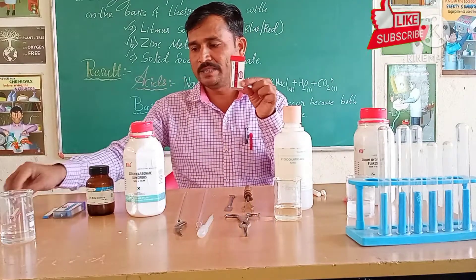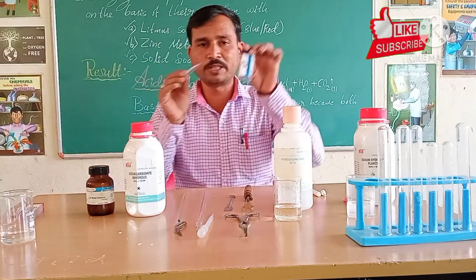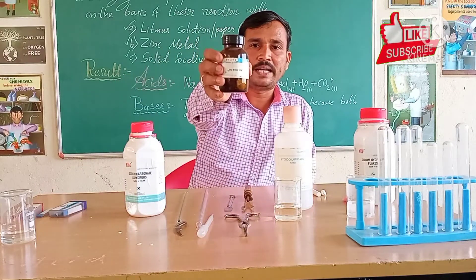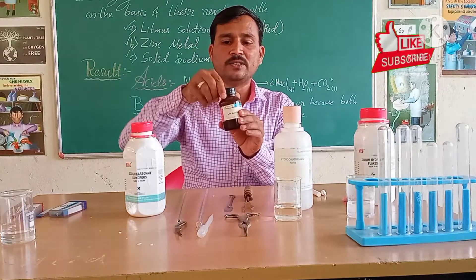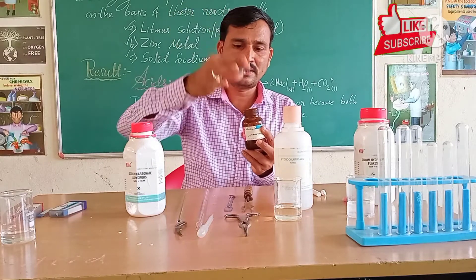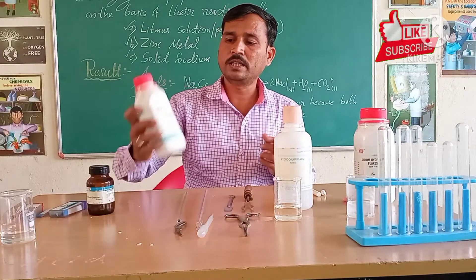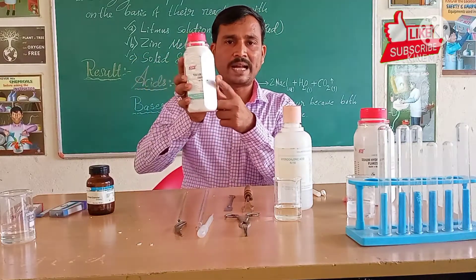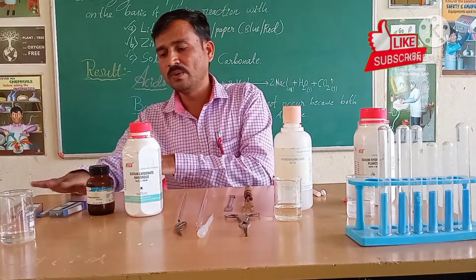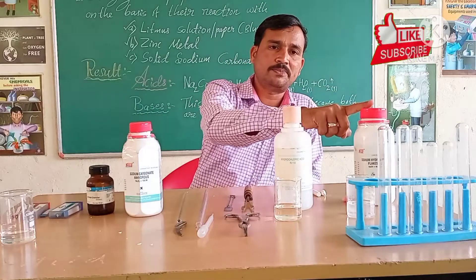Here is the red litmus paper strip and the blue litmus paper strips. Second, zinc metal — you can see these are the zinc granules. Students will check with these zinc granules. Next, here is solid sodium carbonate. We will test each with the respective acid and base.